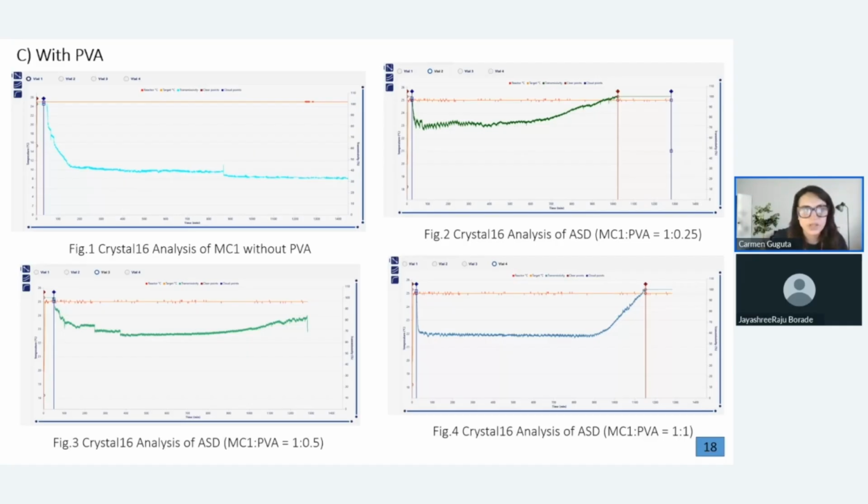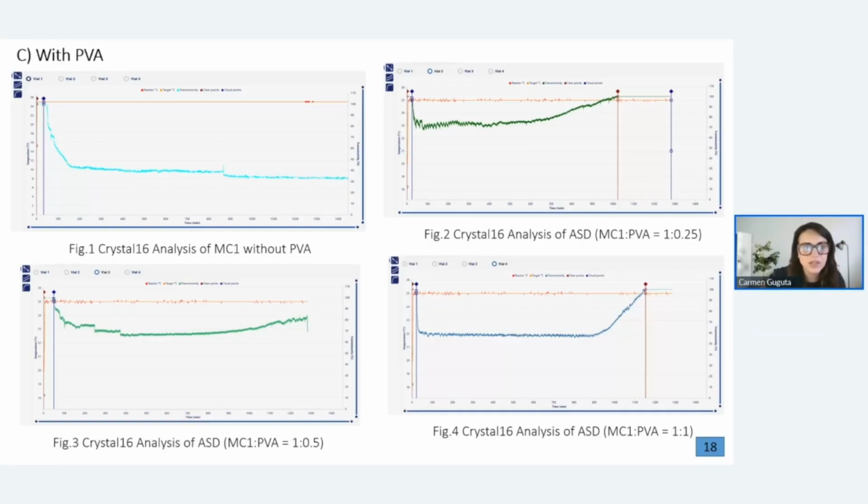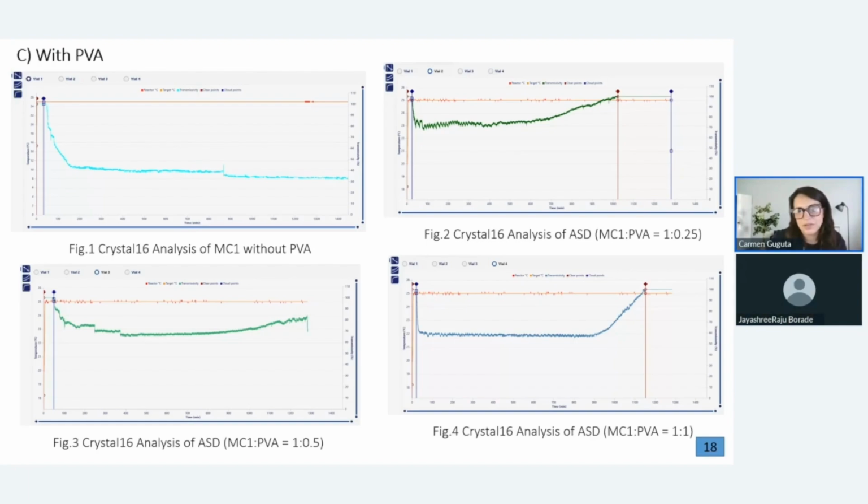Another question: can we evaluate the surfactant effect in delaying nucleation in supersaturation for screening suitable surfactant selection? I think that would require some modeling. I haven't seen this in your studies. Have you done such a study?